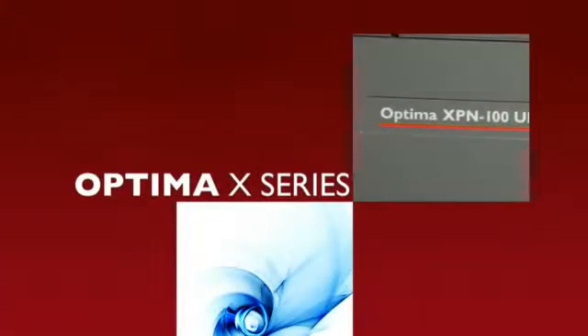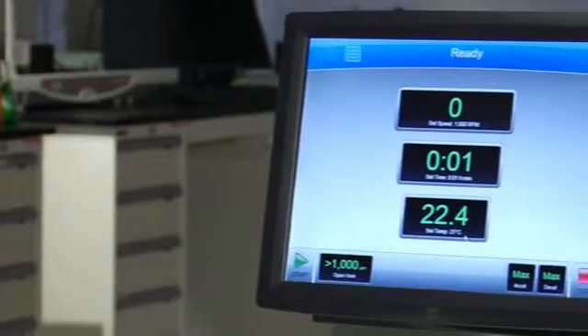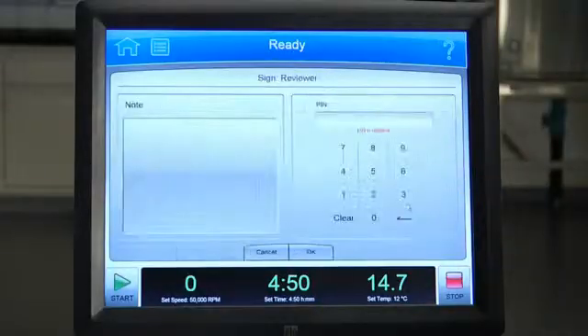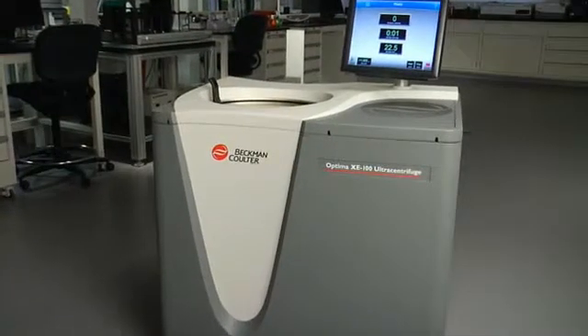The Beckman-Coulter Optima X-Series Ultra Centrifuges cover the spectrum of your lab needs. It's the largest touchscreen monitor in the industry with powerful performance, remote control functionality, security, data tracking, and reliability designed with a total system approach.